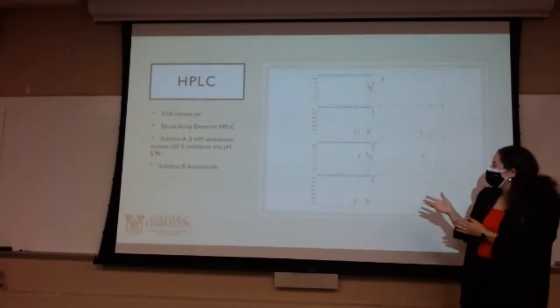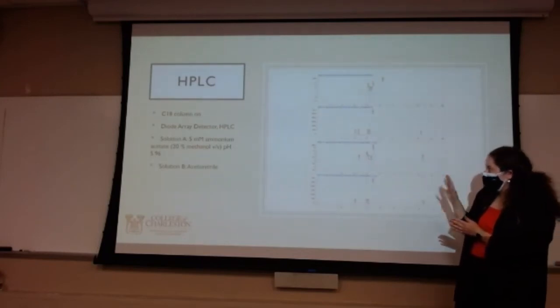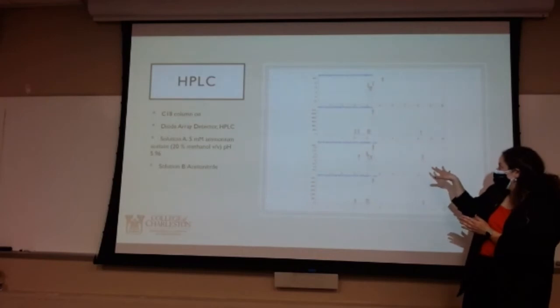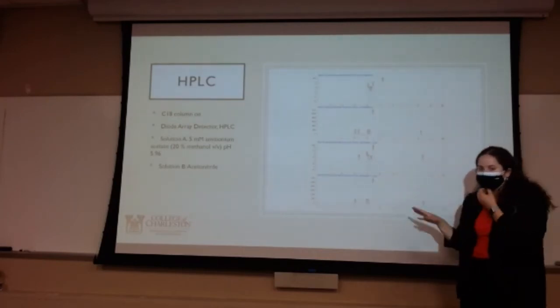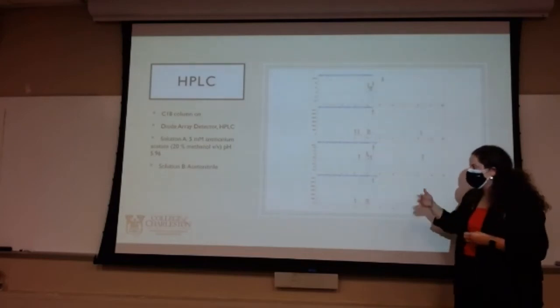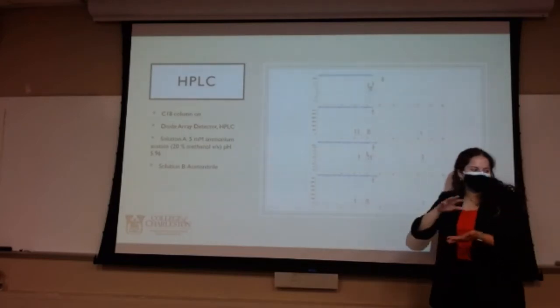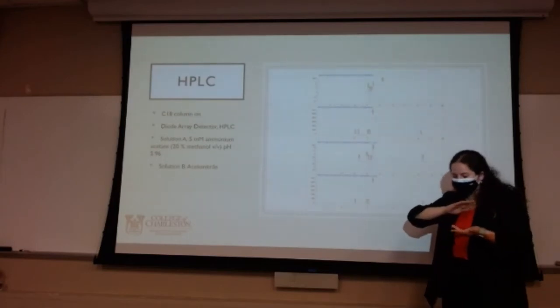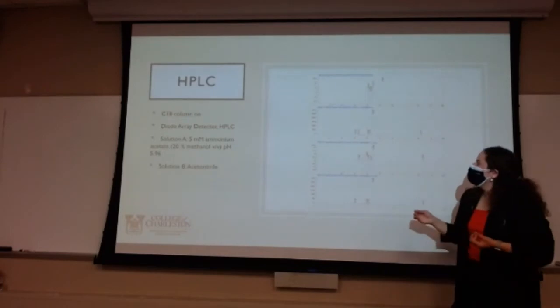From this year, I was able to figure out a retention time for my L-arginine standard of 8.322 and a retention time for my L-citrulline of 5.2, based on continuous trials with it. And for the whole thing, I do just an elution hold. So I don't change any concentrations. I keep it the same the whole time.